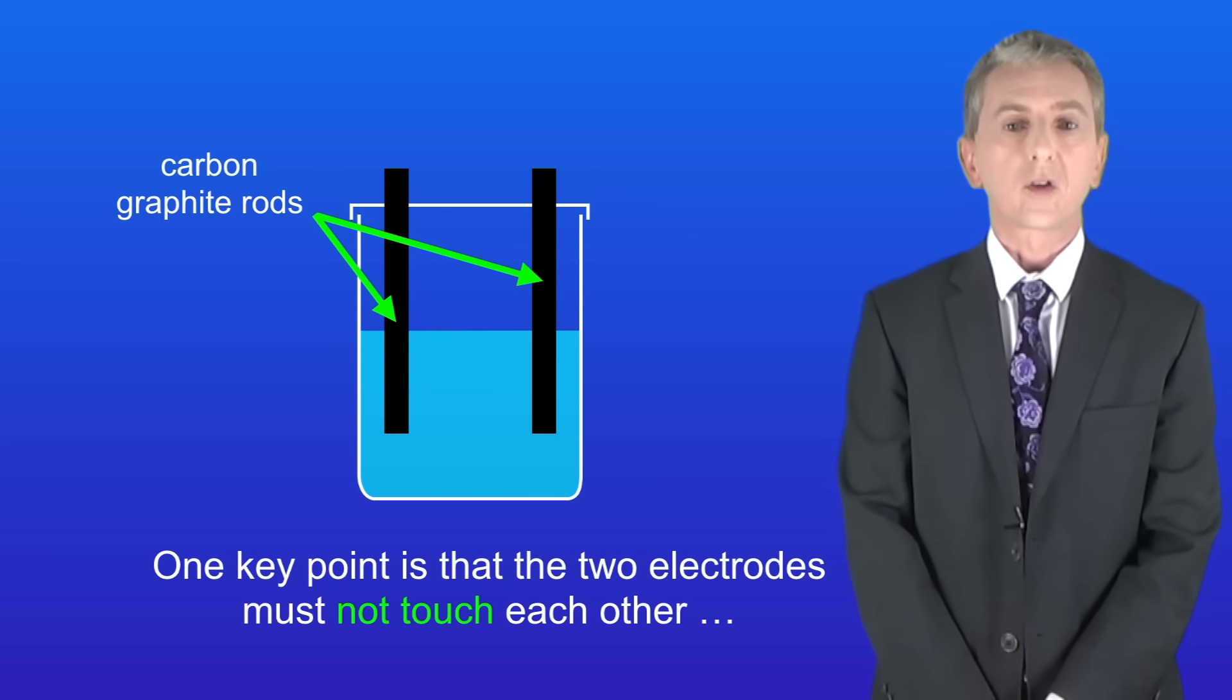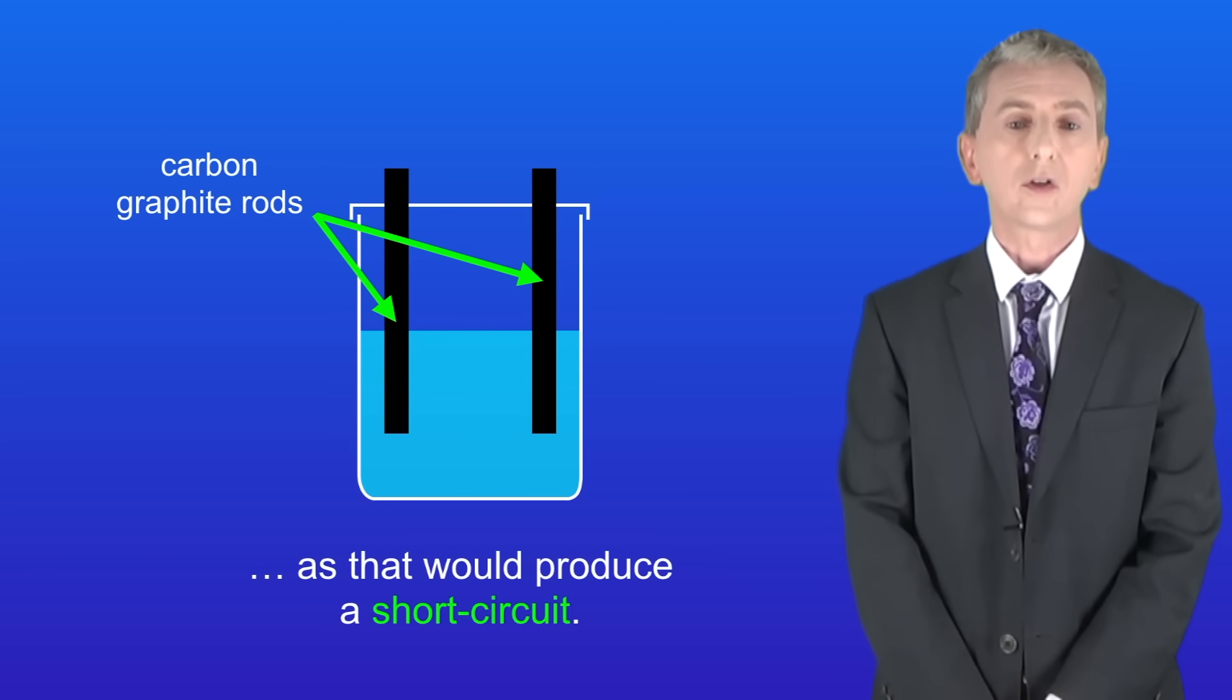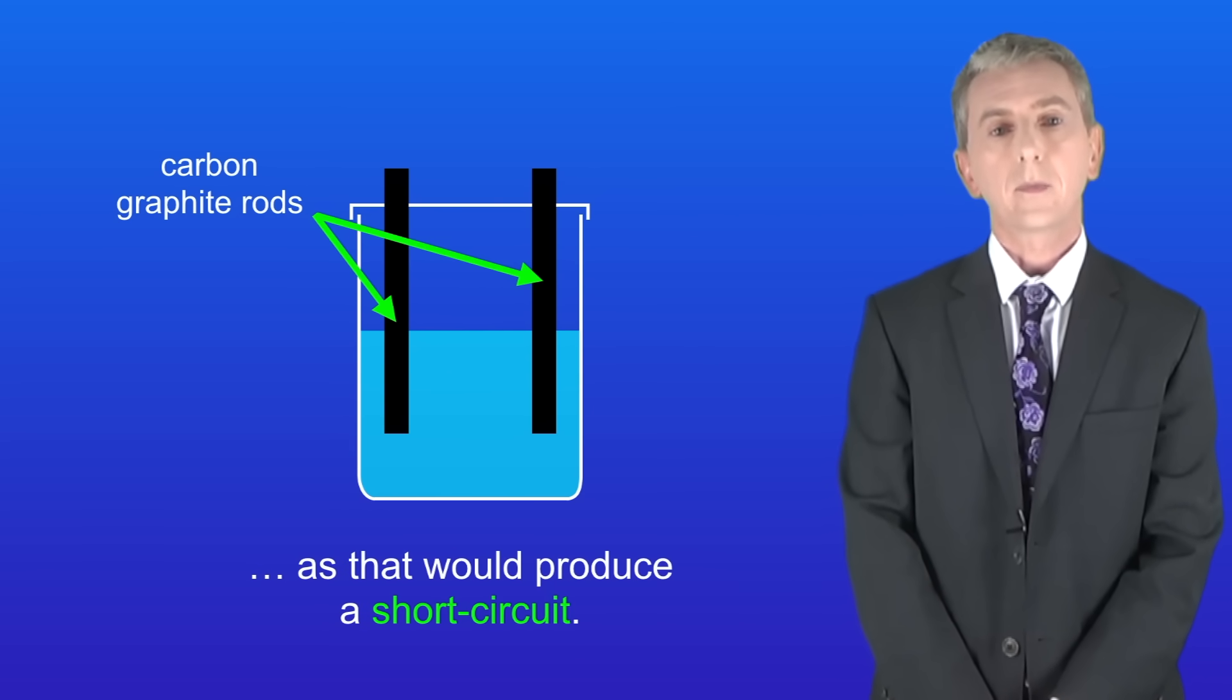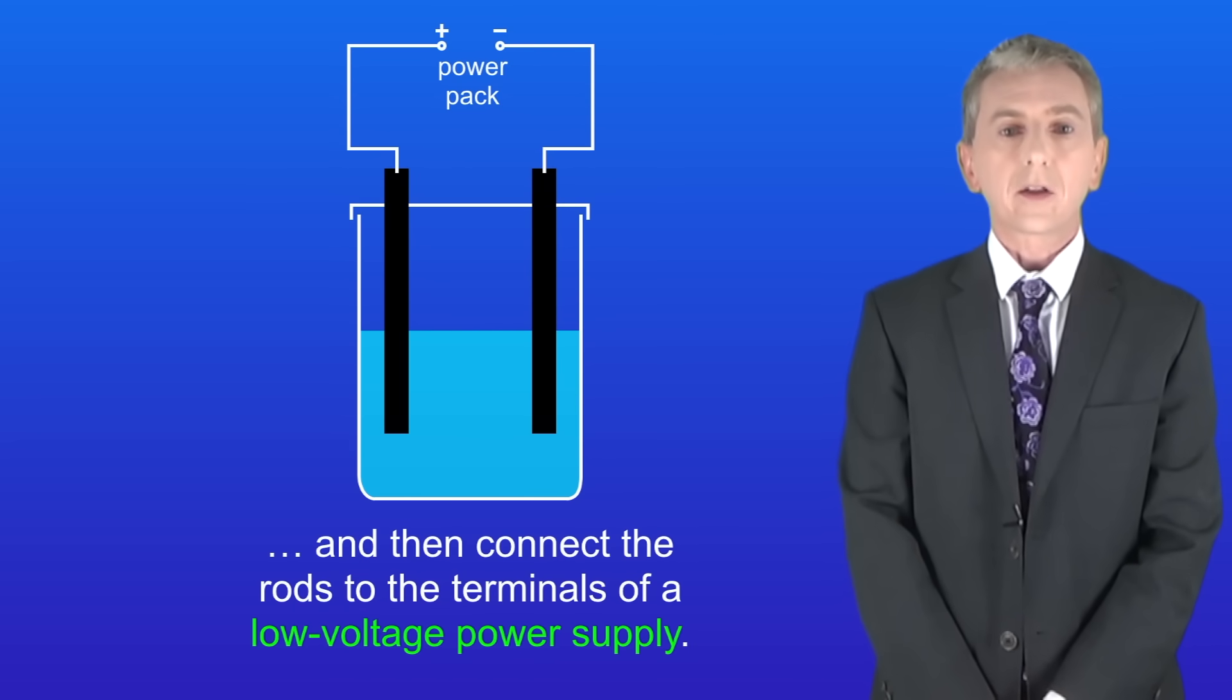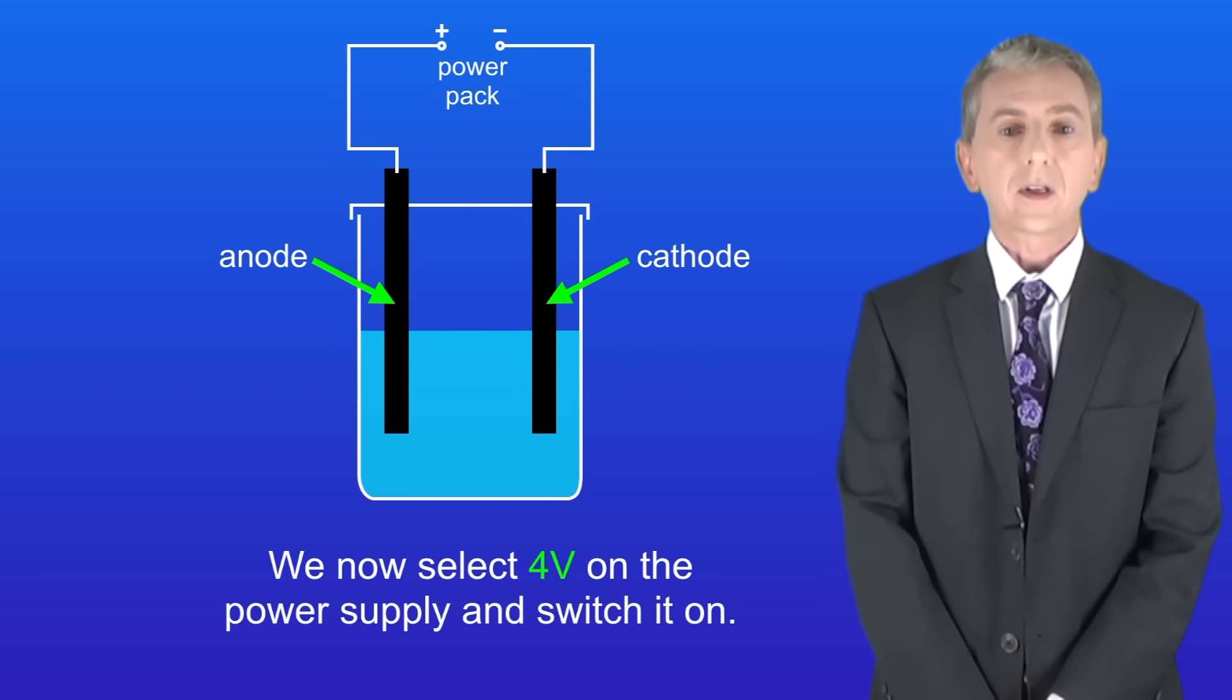One key point is that the two electrodes must not touch each other as that would produce a short circuit. Next we attach crocodile leads to the rods and then connect the rods to the terminals of a low voltage power supply. We now select 4 volts on the power supply and switch it on.